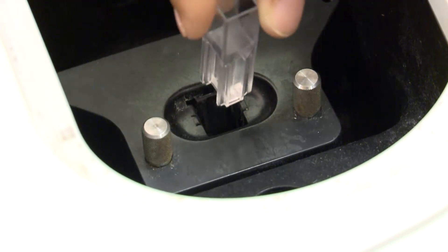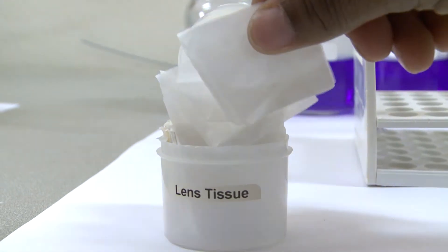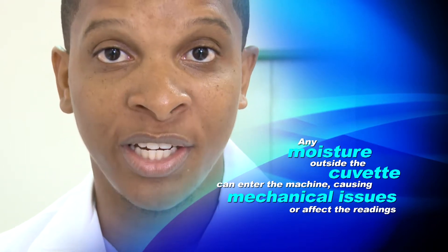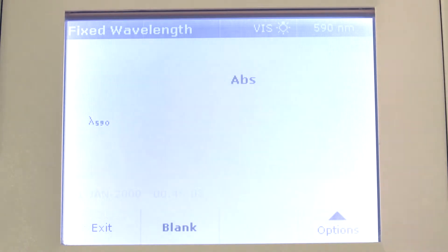To calibrate the machine, fill the cuvette with your blank — which is water — and place it into the spectrophotometer. Before measuring your sample, make sure your cuvettes are completely clean. Some solution may have spilled on the outside of your cuvette, so wipe it gently with lens tissue. Any moisture on the outside can enter the machine, causing mechanical issues or affecting your readings. The machine has warmed up, and as you can see on the display, you only have an exit and a blank option. You can only begin reading your samples after you have blanked the machine, set a standard, or calibrated it. To blank it, we will use our solvent water, which we dissolved our crystal violet in.